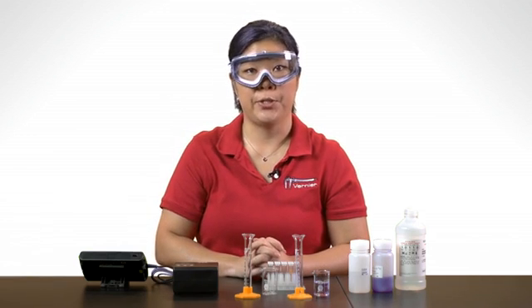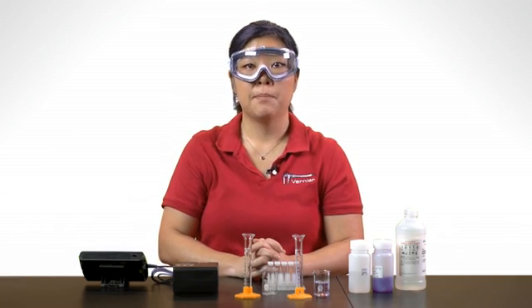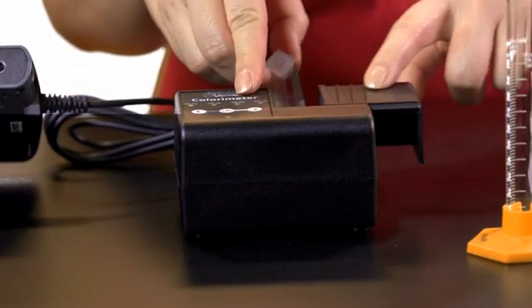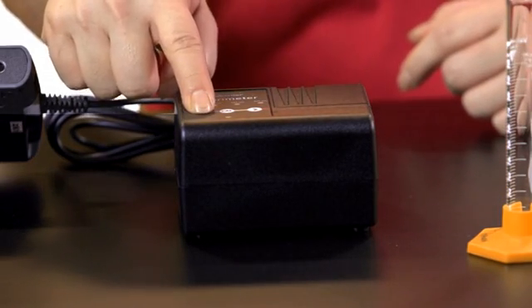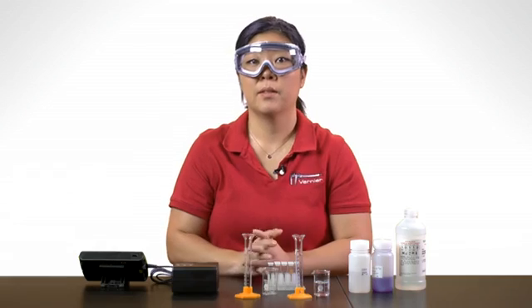Let's work with LabQuest 2 first. After you've connected the colorimeter and LabQuest, place a blank cuvette with distilled water in the colorimeter and choose the desired wavelength. Press the arrows to select the wavelength.